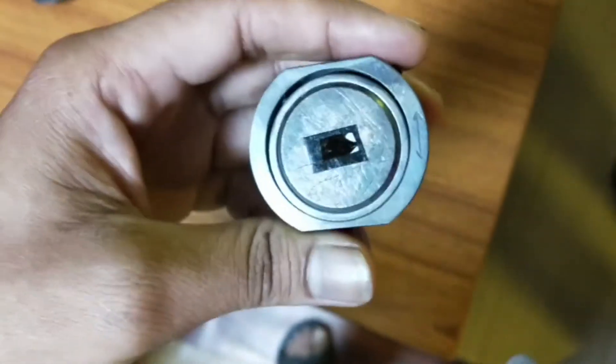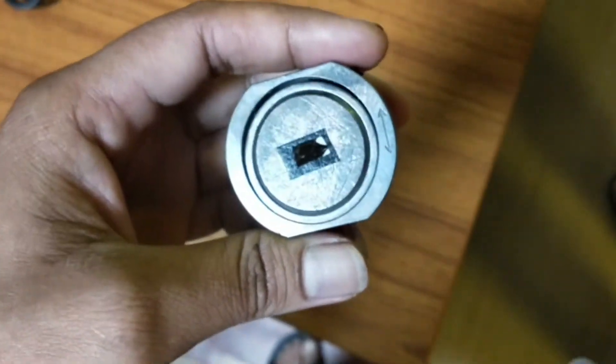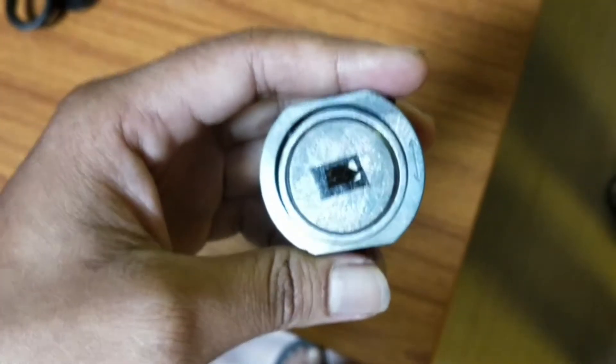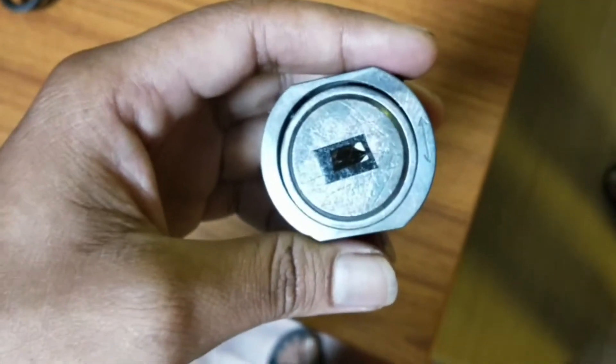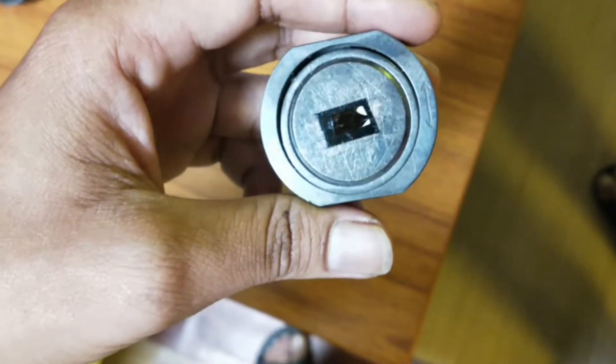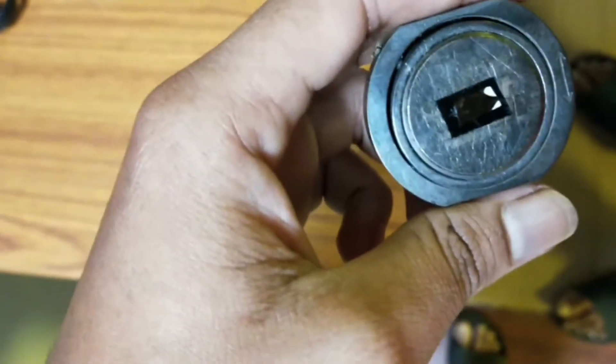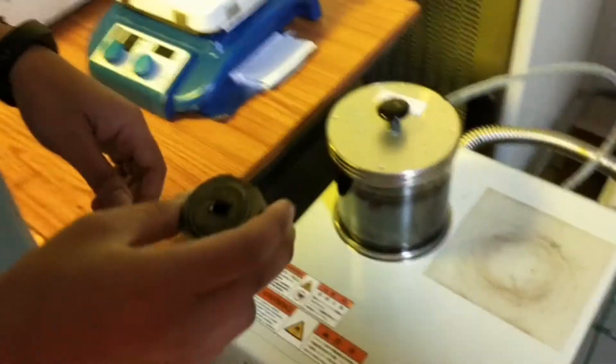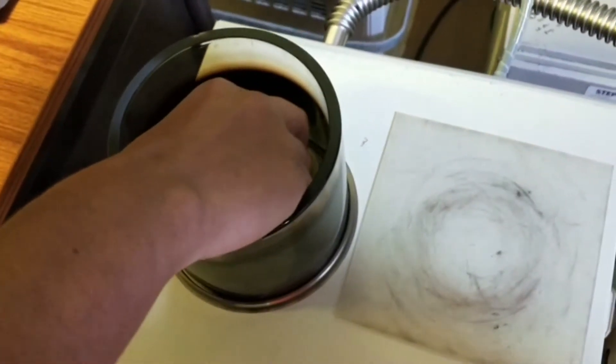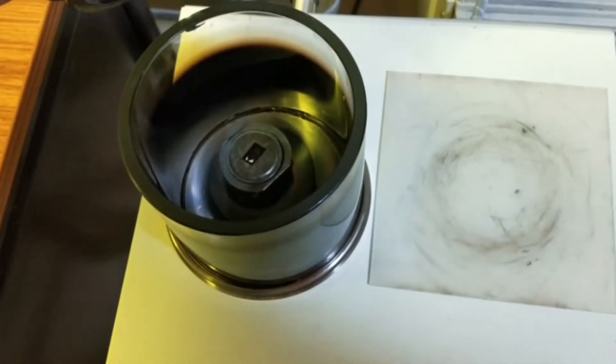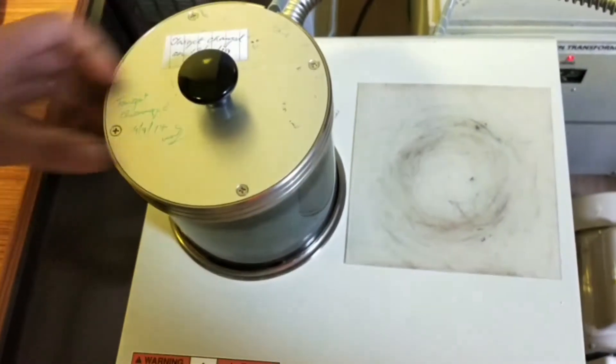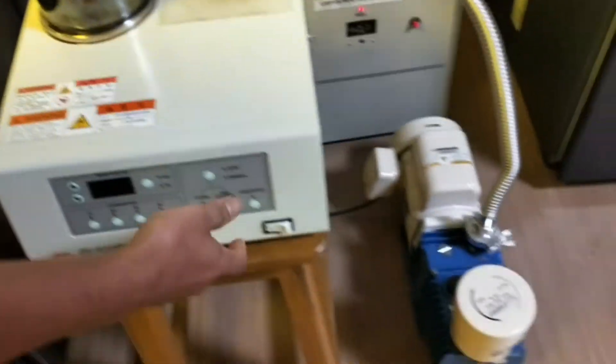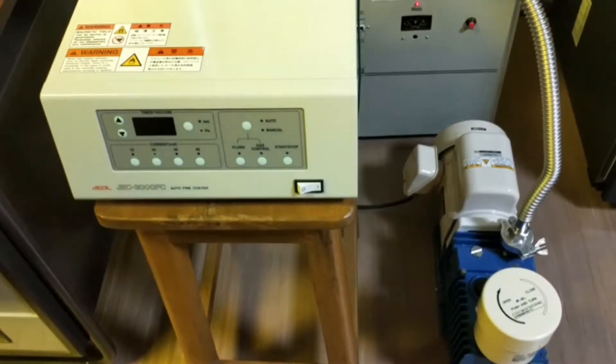Now comes the next part. As this sample is non-conductive, we have to make it a little bit conductive using the sputter coater. We will coat the platinum on this non-metallic surface. This is our sputter coater. This is the chamber where we will put our sample. Once we close the lid, it will get vacuum, and we will switch on this instrument.